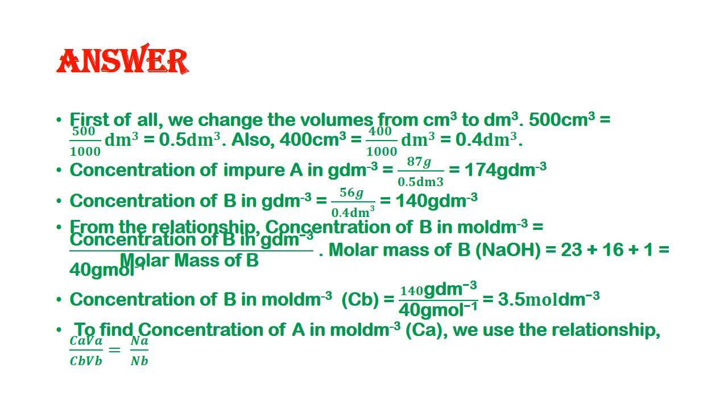Please take note. The concentration that we are preparing for the WAEC practical is very, very small. Not that as I'm getting 3.5 now, if in your own solution you get 0.00 something or 0.0 something, you will be thinking you are wrong. You are correct, because the concentrations will always be very low.